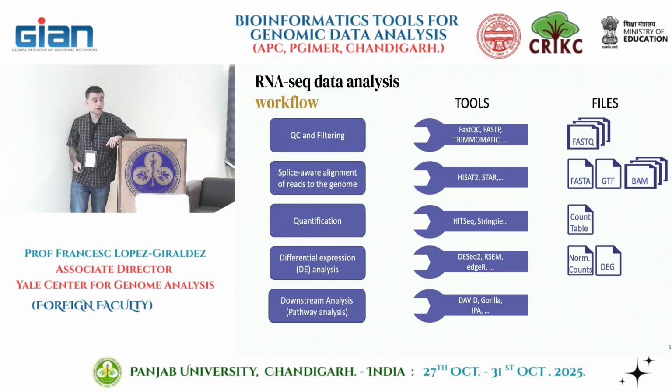We also need another file called GTF. GTF are the annotations for that genome, and we'll see how it looks a bit later. And when we do the alignment process, we're going to get a file called BAM, right? Some of you are already familiar with it. It's where we store our alignments. And all of those are different formats.